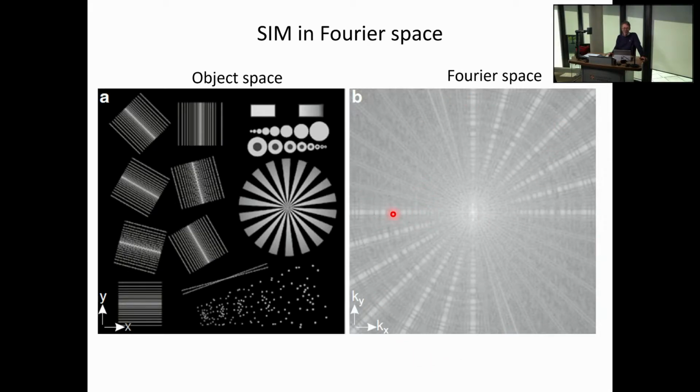a spectrum like that. That's exactly what you would see in the Fourier plane of the objective if we're not clipping yet. So this would be for a very large numerical aperture. You see this frequency here maybe encodes this stuff here, and perhaps some of these features here. And then perhaps you have something around here, and that might be encoding for things that are down there. And so on. And then if you want to look at something intermediate, perhaps you have this frequency component along this direction here, which will encode for these frequencies here.